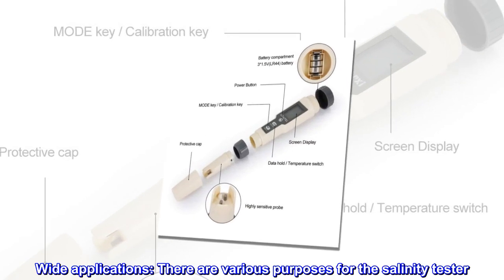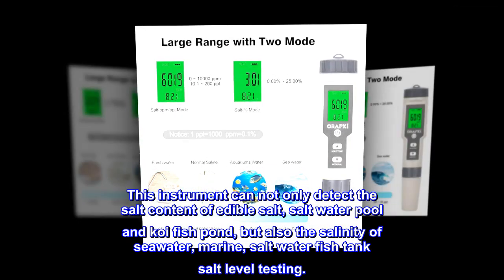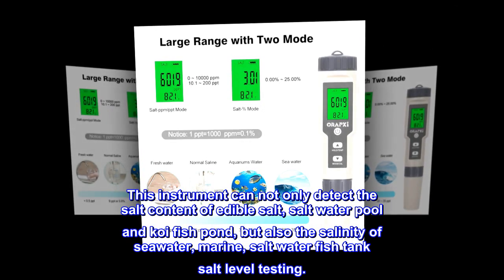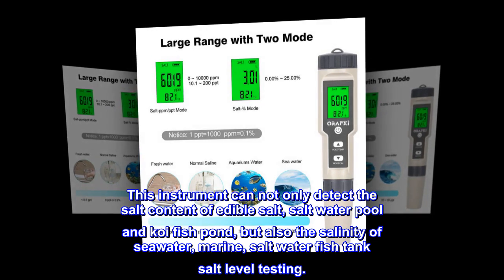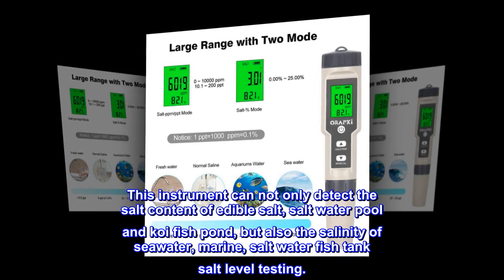Wide applications. There are various purposes for the salinity tester. This instrument can not only detect the salt content of edible salt, saltwater pool, and koi fish pond, but also the salinity of seawater, marine, and saltwater fish tank salt level testing.